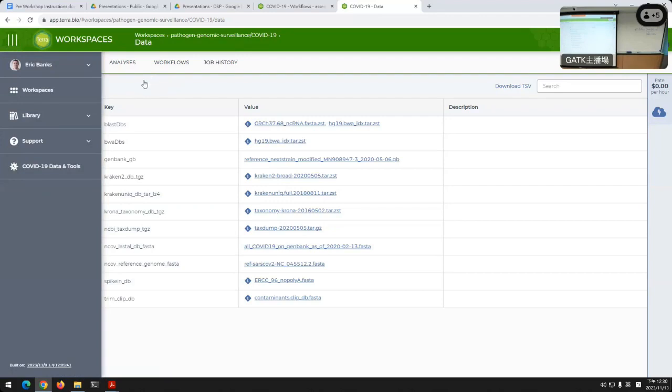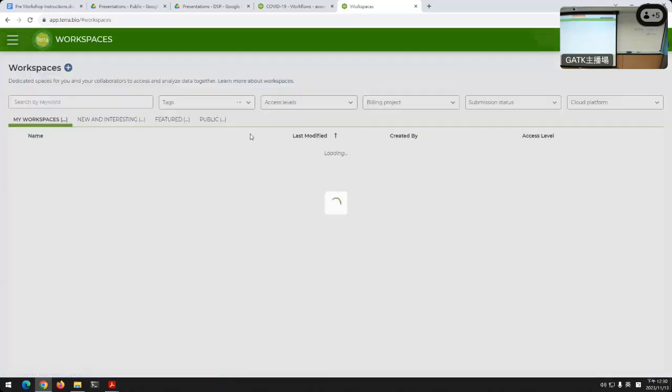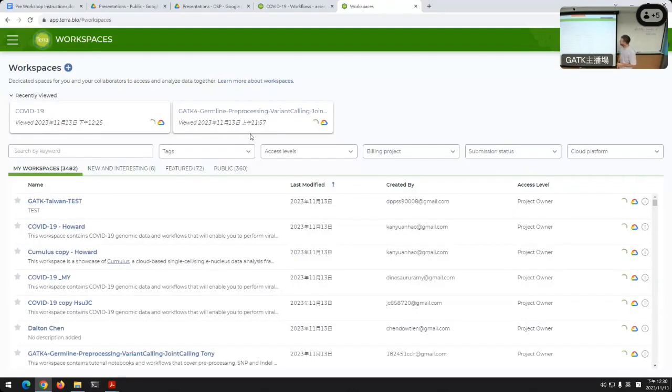Okay, so what we're gonna do now, I'm trying to think if there's a faster way for me to do this. This is gonna take a hot second. I should have clicked on this and then asked if people had questions. So now you want everyone to do this also, right? Okay, this is the part that everyone should be following along with. I'm not showing up. Oh, I see. Take the training wheels off, right?